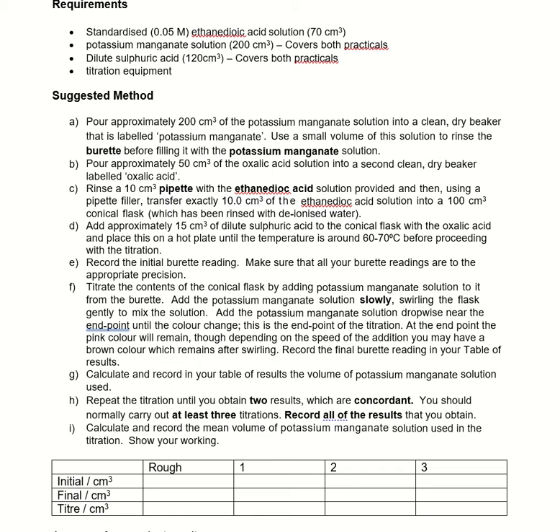First off, as we can see, it's a case of rinsing the pipette with the ethane dioic acid. We're going to put 10 cubic centimetres into a 100 cubic centimetre conical flask, add a bit of sulphuric acid, and just making it up.